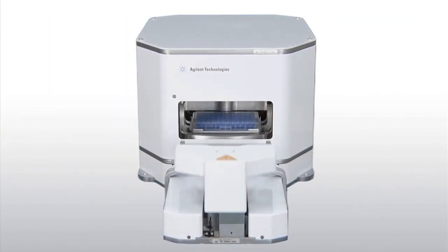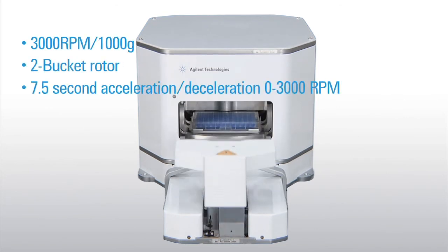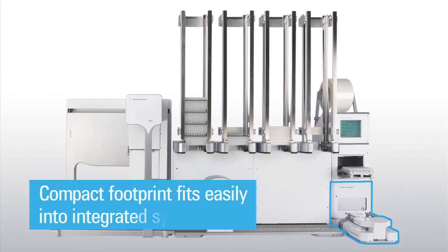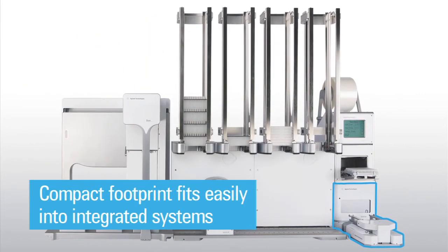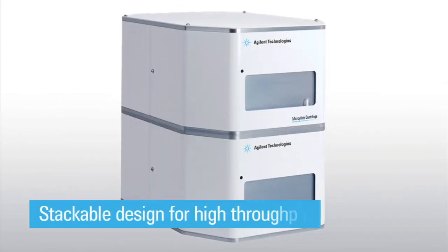The microplate centrifuge is capable of rapid, customizable acceleration and deceleration, minimizing the required cycle time. Its compact footprint takes up very little bench space and fits easily into integrated systems, while its stackable design allows for multiple units to be stacked on each other for increased throughput with no additional bench space needed.